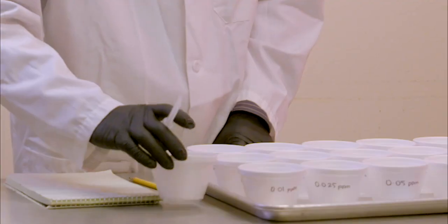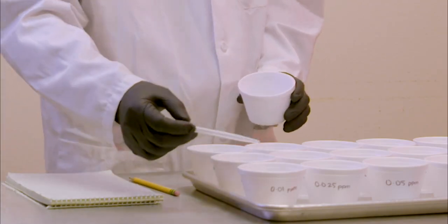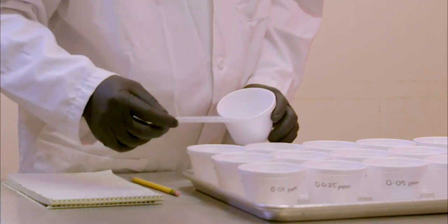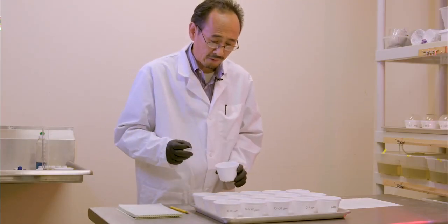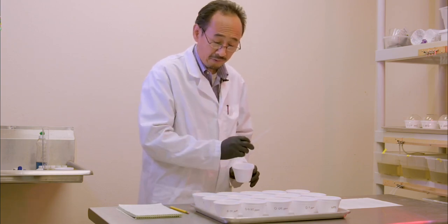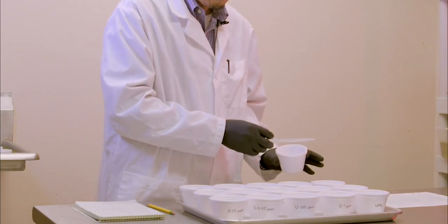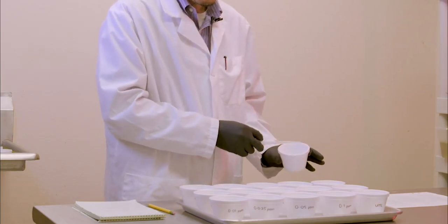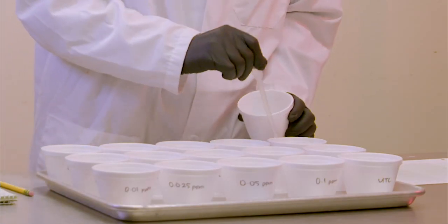So the principle would be you rate your lowest concentration, all 3 replications, first. Always start from low because your dropper is going to dip the water from low to high through these 15 cups. You can rate all the replicates in the lowest concentration and score the mortality in each, until you count the number of survivors in the highest treatment concentration, where most of the larvae should be dead.